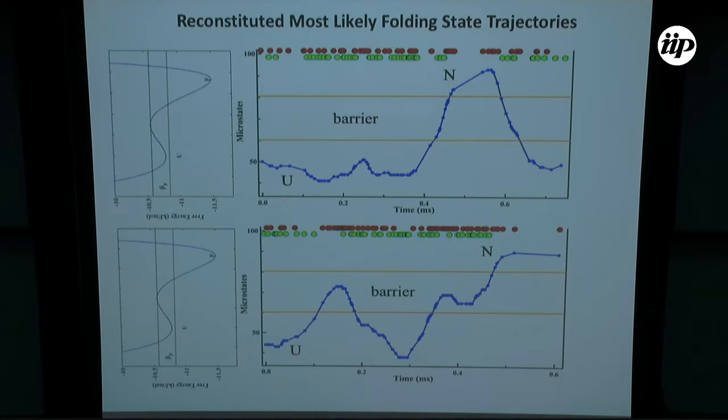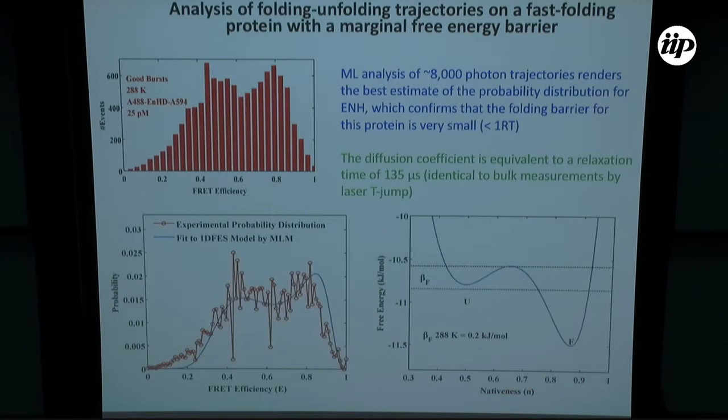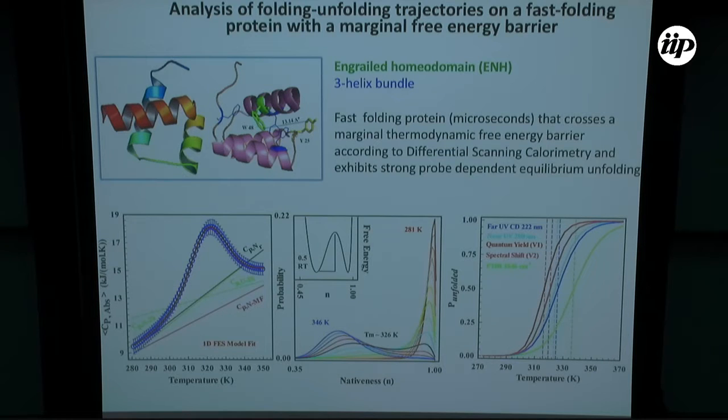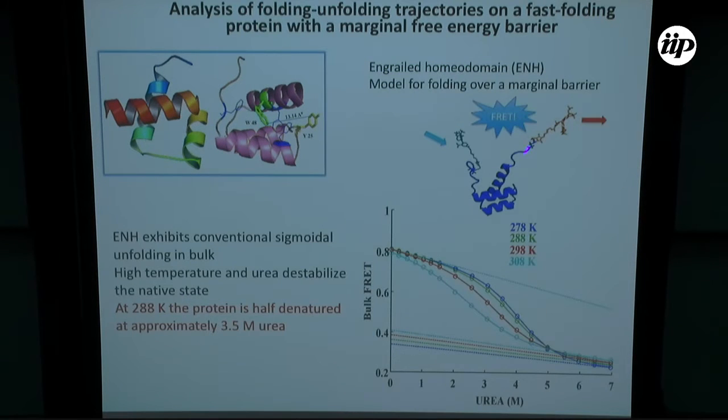And first of all, you can design the positions for the dyes so they are not very disruptive. Like, for example, in our case, we put them in tails, long tails, right? Right, so we actually build a little polypeptide tail, which is flexible, and then we put the dye.